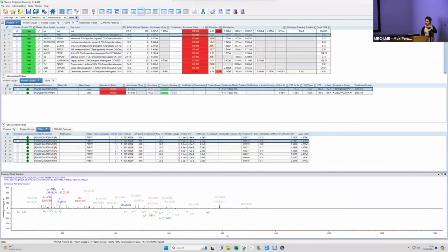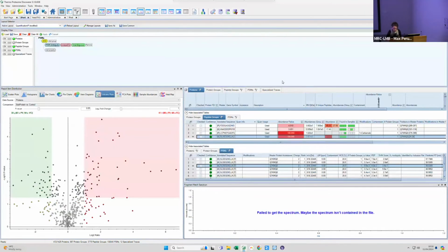So the 100 ones are the ones that you don't actually see in the controls, and that's very straightforward. But you might see one protein that's present in the control, and it's present in your bait as well. But the difference in abundance is so big that I would be very careful in saying that this is an unspecific binder. Probably it is not. It might also work as an unspecific binder, but it is more specific to your bait protein than to your control, your GFP or whatever you're using to do the IP. You can actually look at an example of this.